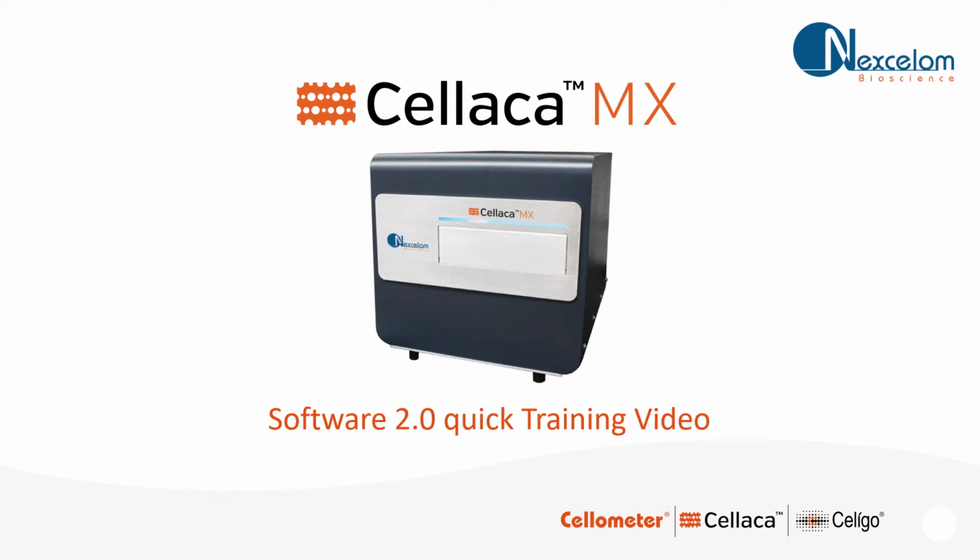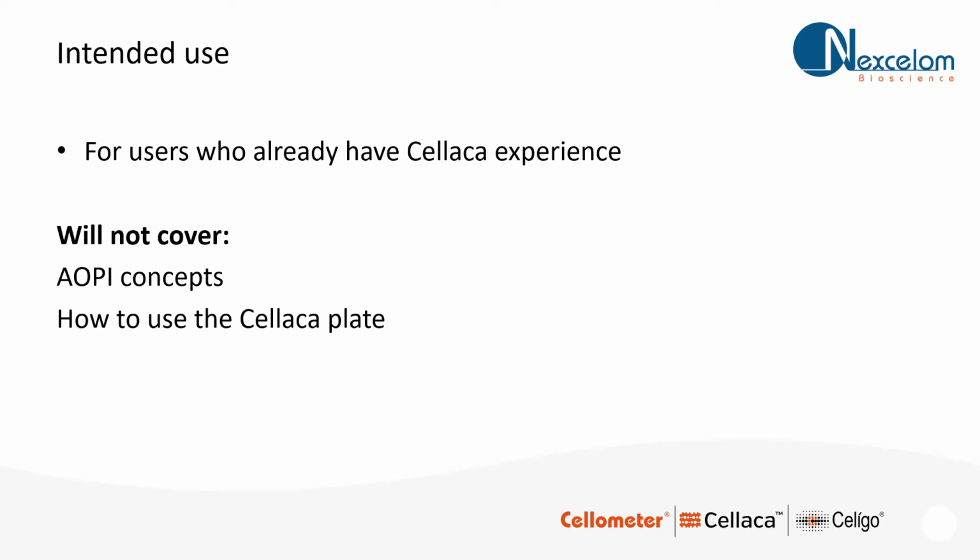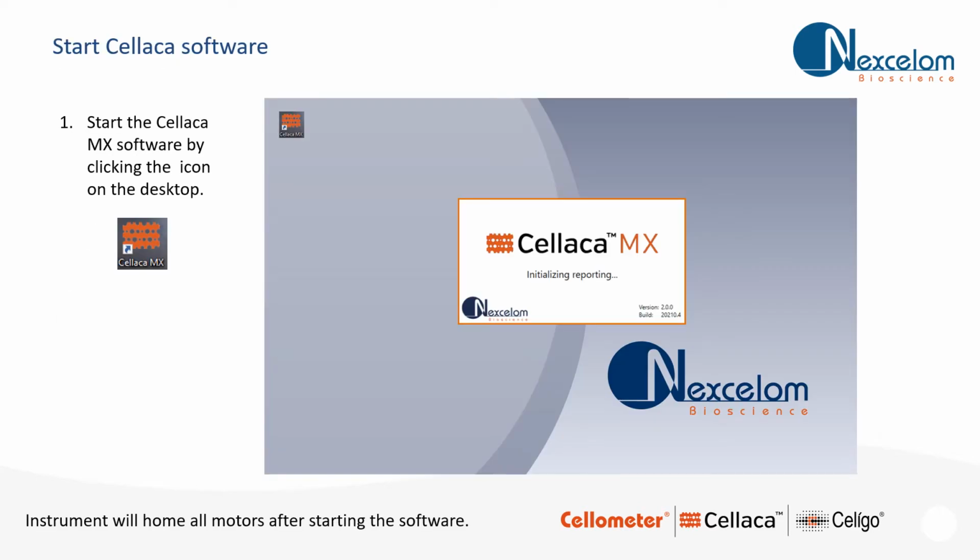Welcome to the training video for Cellaca 2.0 software. This video is intended for users who already have Cellaca experience. We will not cover AOPI concepts or how to use the Cellaca plate. As with the previous version, the software is launched using the icon on the desktop or in the Start menu.